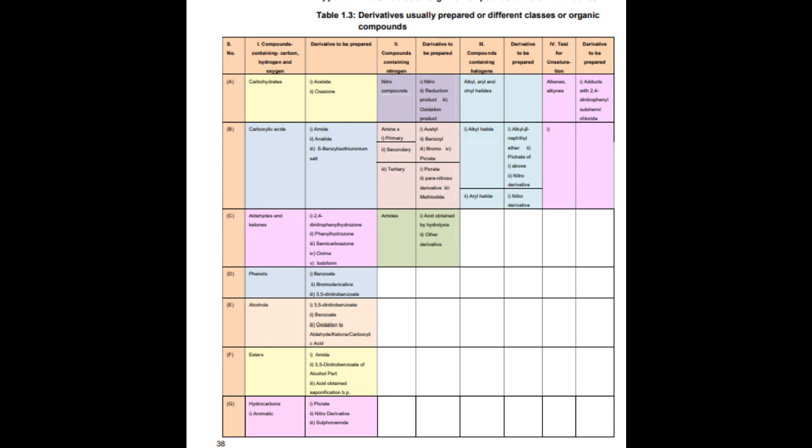2. The color of the silver halides and their solubility in ammonia solution are not dependable observations for inferring the presence of a specific halogen, Cl, Br, I, in an organic compound, because the amount of sodium halide formed by fusion of the organic compound with sodium is very small. Even silver iodide, which is present in very small amounts, will be soluble in excess of ammonia solution. Thus, a positive silver nitrate test only indicates the presence of a halogen. To find out which halogen is present, the layer test should be performed.